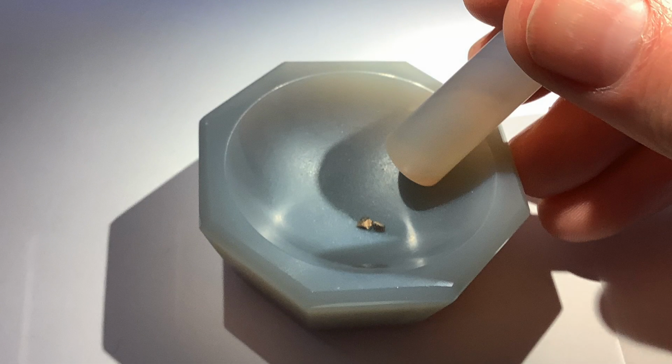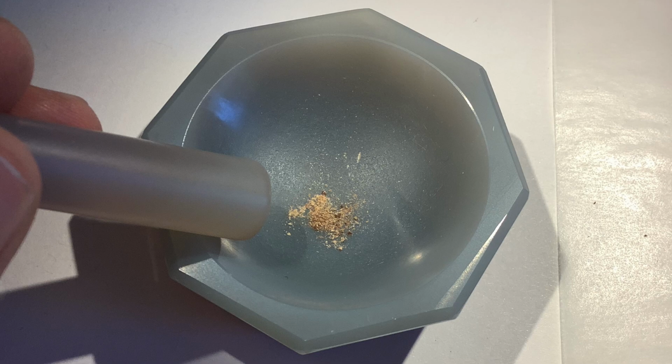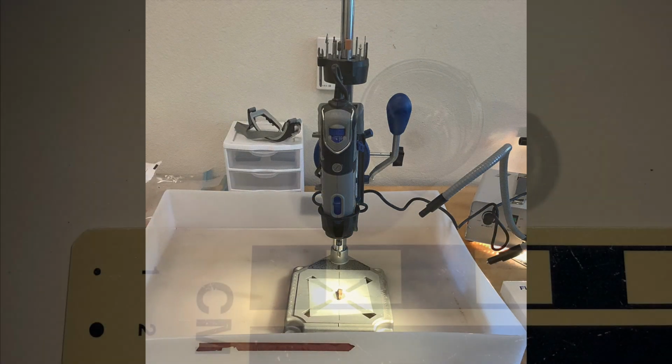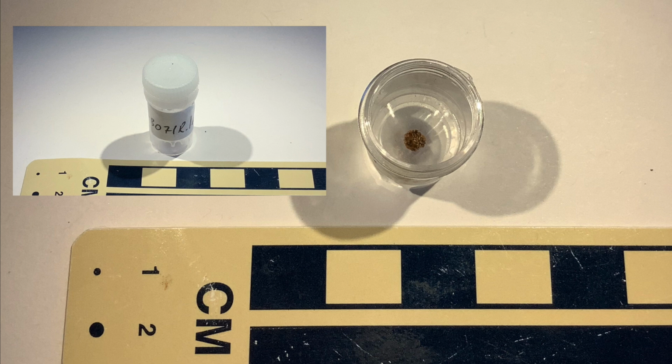Then, we powder the sample by crushing in a mortar and pestle or by grinding with a Dremel power tool. We collect all our powders in well-labeled vessels, and then they are ready for aliquoting for isotopic analyses. We'll show you these procedures in the upcoming videos.